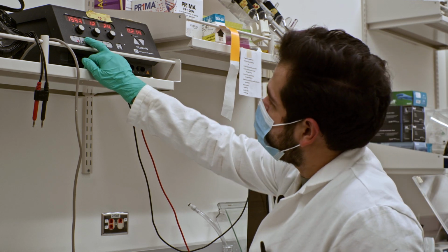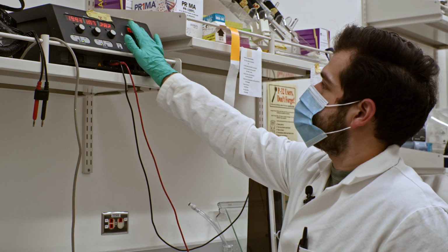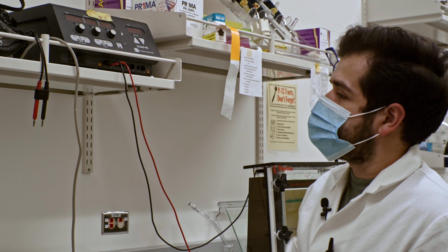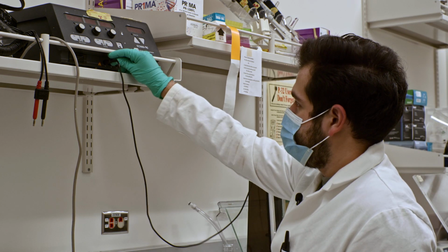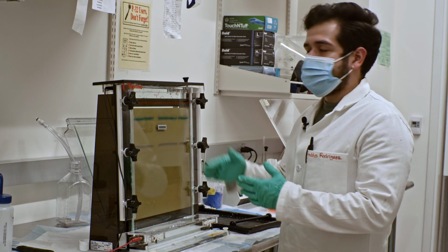You can do this by pressing off on the generator itself, and you can see that all the volts and milliamps have gone to 0. Then we also flip the switch in order for it to be completely off. Take the anode and cathode out, so there is no more current running on this gel. Now we can do the other steps.